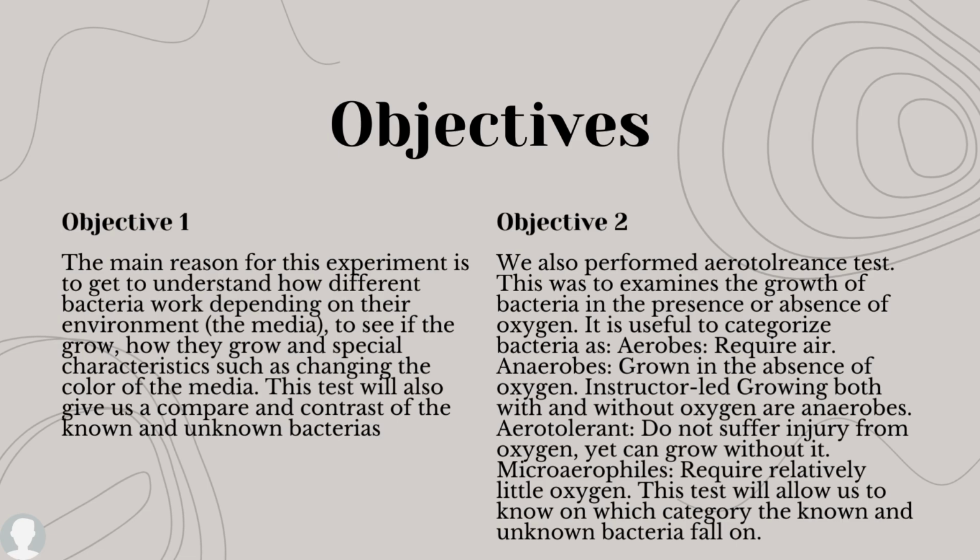We also performed an aerotolerance test, to examine the growth of bacteria in the presence or absence of oxygen. With this, we're able to categorize the bacteria as aerobes, which require oxygen, or anaerobes, which can grow in the absence of oxygen. Aerotolerant bacteria do not suffer injury from oxygen, but they can grow without it. And microaerophiles require relatively little oxygen. With this test, we're able to know what category our knowns and unknowns fall under.